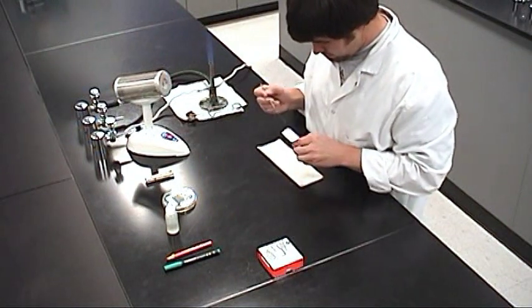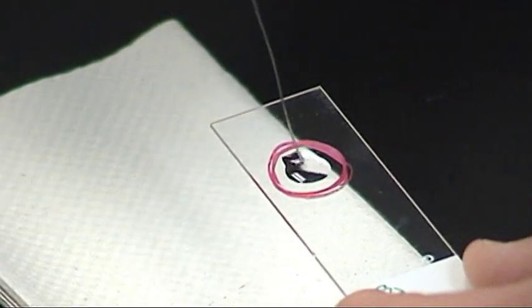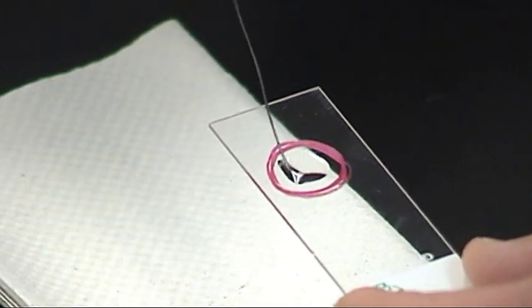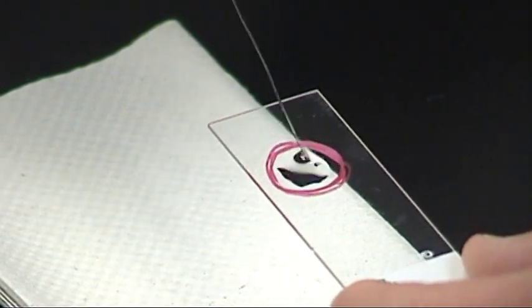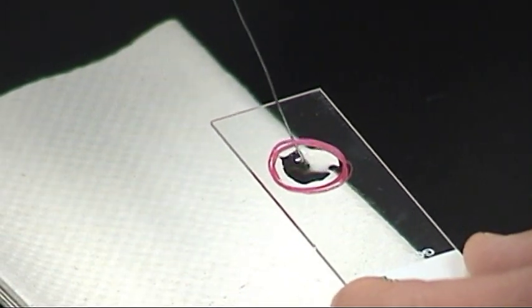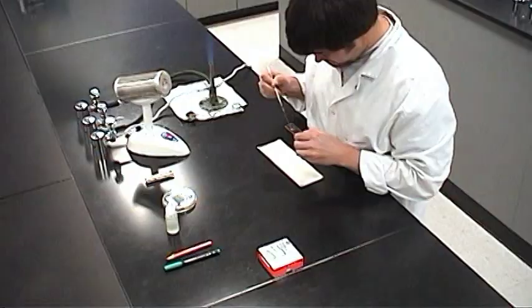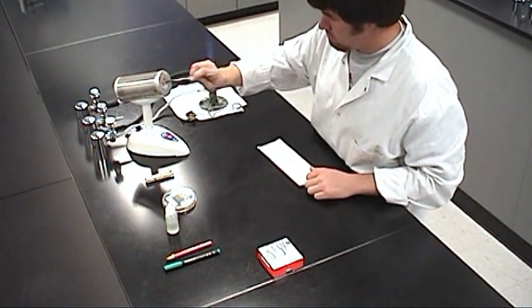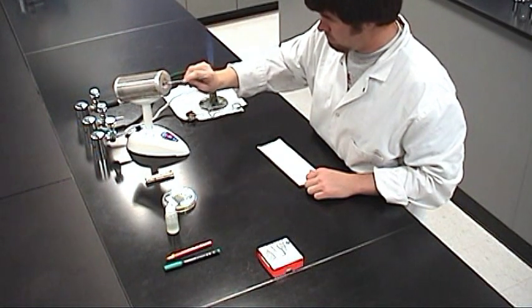Pick up the slide and mix the sample into the water on the slide. Spread the mixture around on top of the slide, staying within the area over the target circle. Flame the inoculating needle one last time, then put it aside.